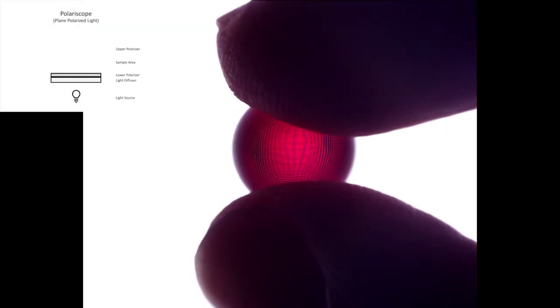Now let's examine this direction through our sphere in plane polarized light. Given this view along the optic axis, when we rotate the sample we shouldn't see pleochroism, because light traveling through this direction should only be interacting with refractive index omega — barring complications from the spherical geometry. Let's try rotating the sample and see if we notice any pleochroism. There's not much change going on. The differences you do see are caused by the camera adjusting brightness as fingers move in and out of the field of view. This is the 10 millimeter corundum sphere, which is a little difficult to manipulate. Bringing in the upper polarizer confirms we haven't wandered too far from the optic axis, so that was an accurate representation of the lack of pleochroism in this direction.